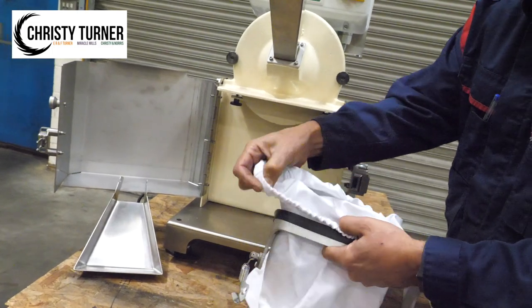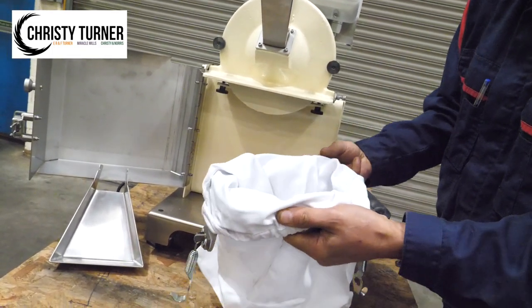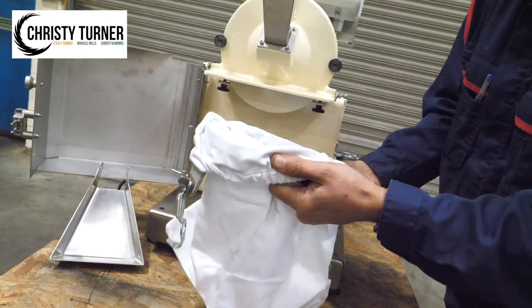The heavy-duty cotton collection bag supplied with the mill fits easily over the bag holder, to collect the test material and act as an air filter.